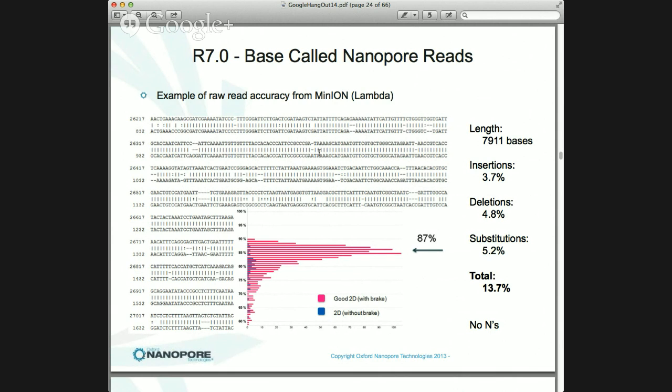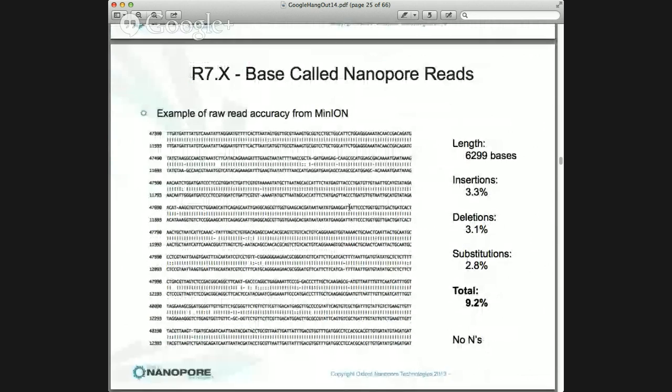And on the version of the base caller that's in the field right now, this would be the typical distribution of 2D error rate, counting all errors, for want of a better word. Now, I don't like talking about this because if you parameterize the base caller differently or you change a few things, you can move these numbers around quite dramatically. And more importantly, the base caller we have, which is available to mappers, is not fully feature functional yet. In other words, we haven't put in all of the whistles and bells. And mappers who've been digging into these data, if you go and look underneath these bad bits, you will see signal. And you will see sequence-specific patterns in those signals. And I know that people have been implementing error corrections and things. So there's still, I think, a significant uplift just in software.